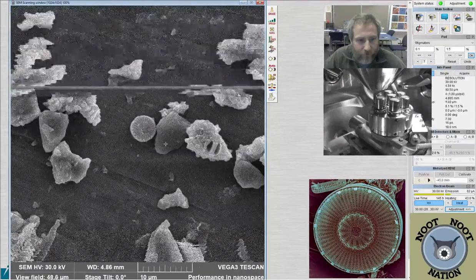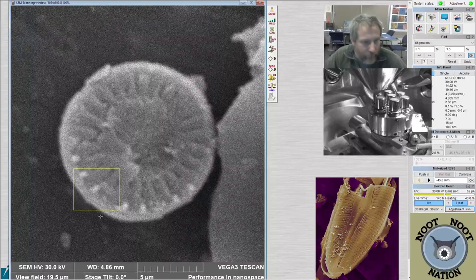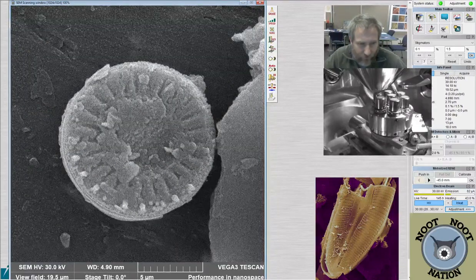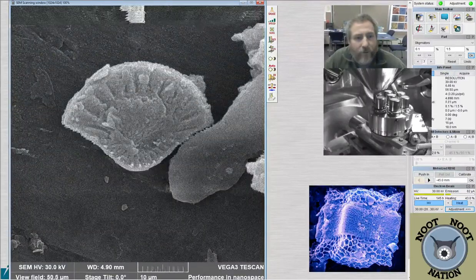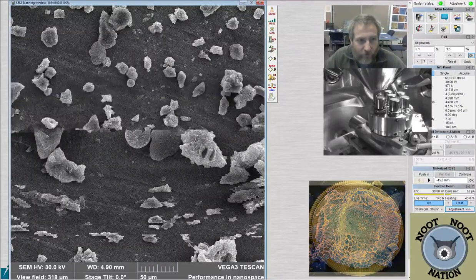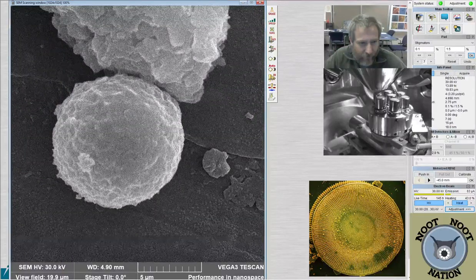Yeah, that's Cyclotella meneghiniana right there, I think. Oh, no, that's a Discostella, actually. That same Discostella from before. Pretty sure. Oh, no, Cyclotella meneghiniana, I think. It's just got a lot of stuff on it. Covered with some clay. There's another particle up here. Oh, I don't know what that is. Not a diatom.